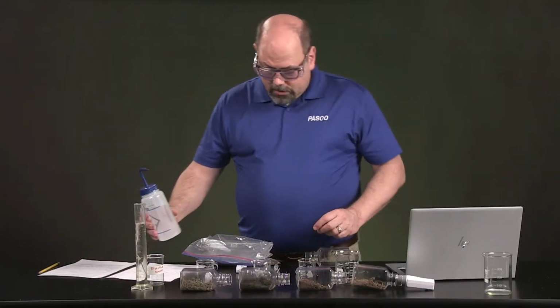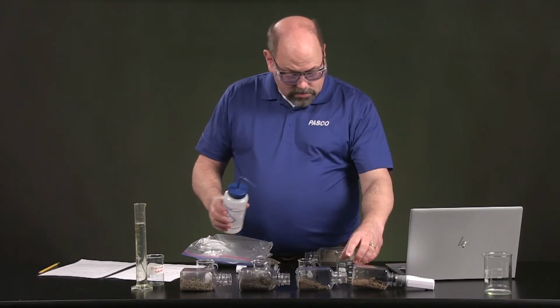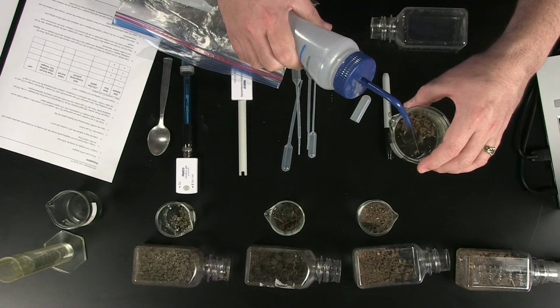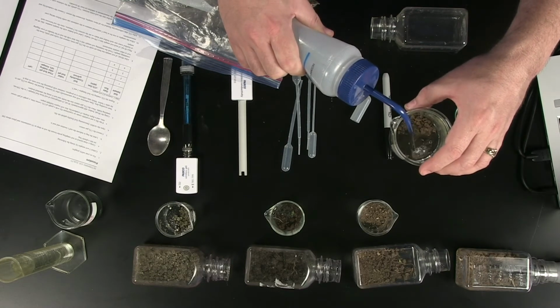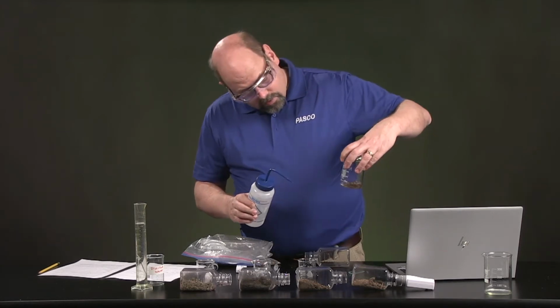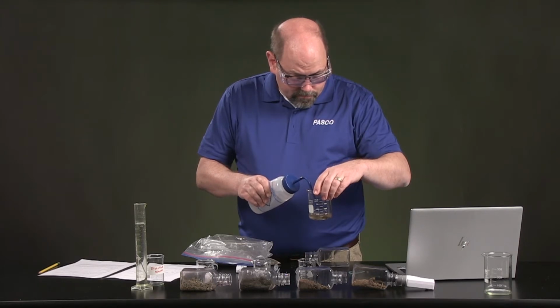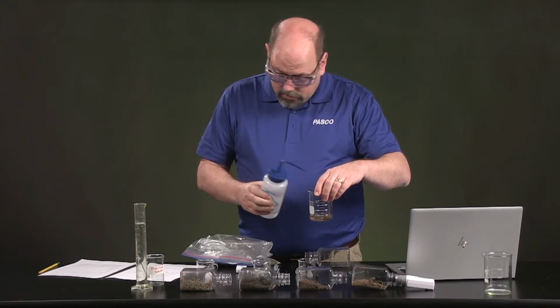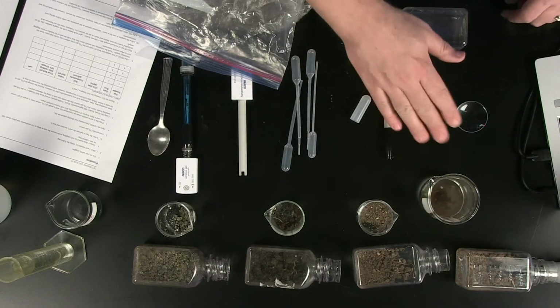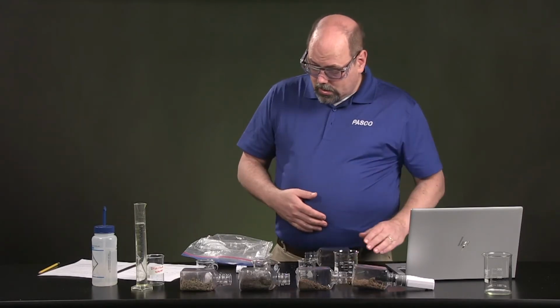What we're going to do is add 40 mils of water to each of these so that you can take your conductivity sensor. I'll just use one of these, this one that I just finished. And I have a mark at the bottom at 50, and so I'll mark it to just below that. Okay, a little bit more. There we go. You want to get those nice and soluble. So that's going to be dissolving any of the salts that are ionic substances that are in each of those.